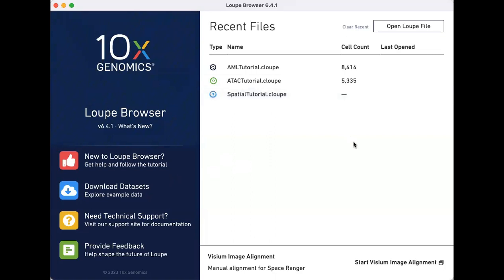To follow along, you must download both the C loop and V loop files available on the 10x genomics public datasets page. Download links are also provided in the written tutorial and the video description below.